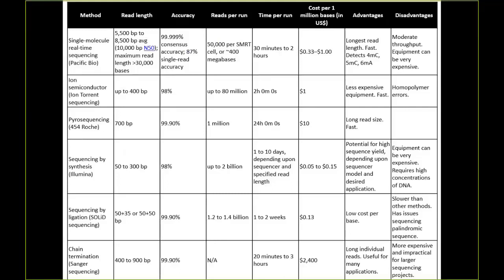Yeah, long reads. That's pretty much the advantage of it. I talk a little bit about the fact that you can detect modified bases with it. I haven't seen too many people doing that, at least in my sphere recently, but everybody loves it for really long reads. So you can read just about across a bacterial ribosomal RNA sequence with this. Or you can read across an entire repeat region of a human genome and see how long it really is.